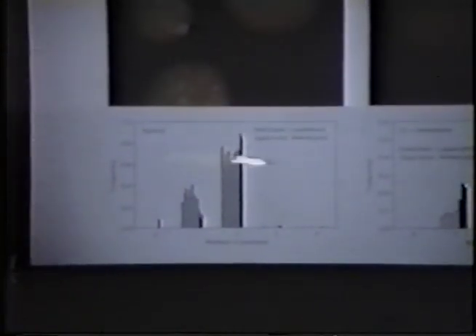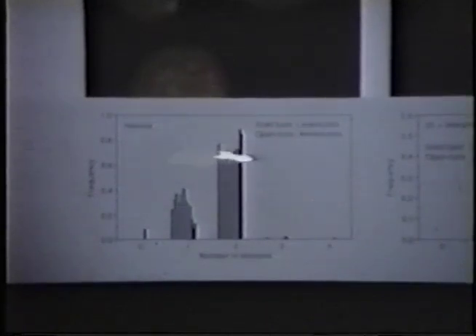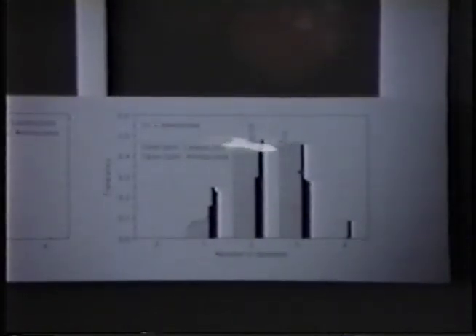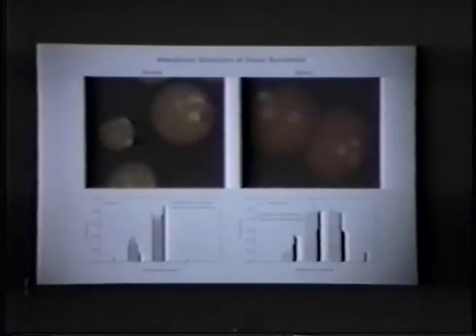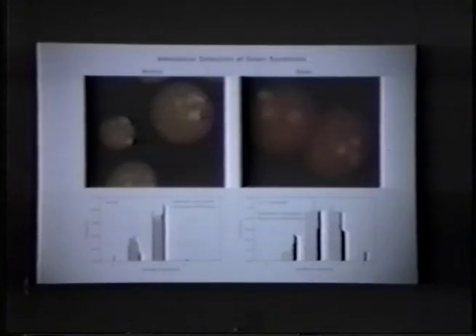And in fact, if you score these normal and Down syndrome cells in a blind way, what you find is that only about 60 or 70% of the normal cells show the expected 2 domains, and only about half of the trisomic cells show the expected 3 domains. And the reason for this is that these produce fairly large hybridization signals. And so there's a reasonable probability that they will overlap and give you an incorrect reading.